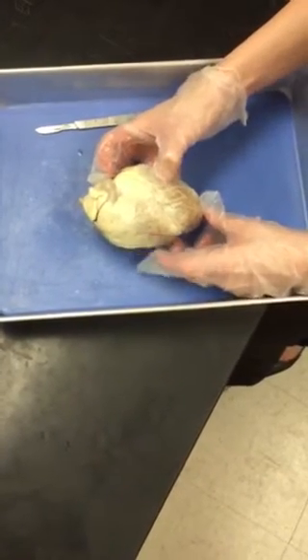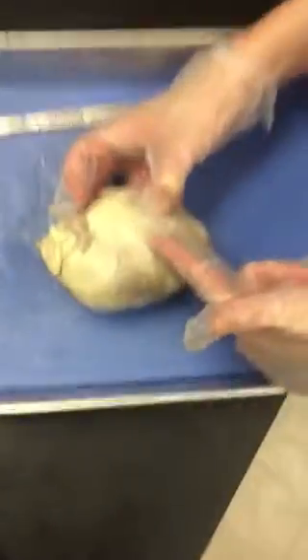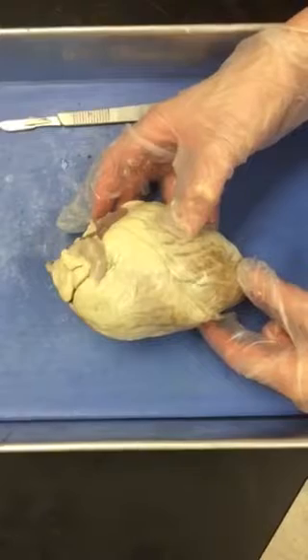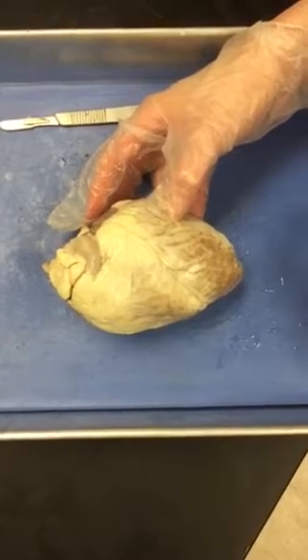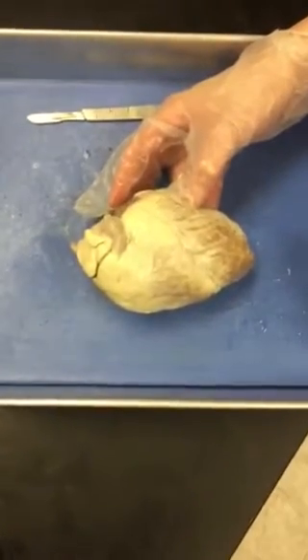Eight, observe the outside wall of the heart. The dark line running from the upper right diagonally to the lower left is the left coronary artery. Coronary arteries provide blood to the heart muscle itself. Remember that all tissues, including the heart itself, need the oxygen delivered by blood. Label the coronary artery with a flag.